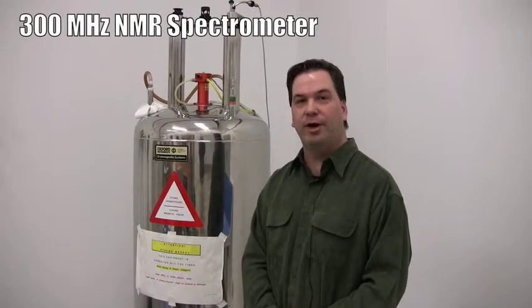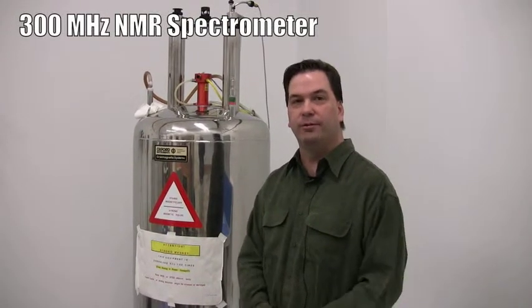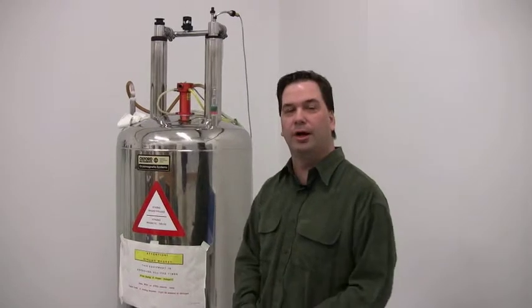This is our 300 megahertz spectrometer. It's currently mainly dedicated to walk-up type applications, for students who have samples that are fairly concentrated and only require 10 or 15 minutes of acquisition time. This spectrometer is set up to acquire proton, carbon, phosphorus, and fluorine NMR in an automated fashion in terms of the users aren't required to move any cables or adjust any electronic components to observe these nuclei.